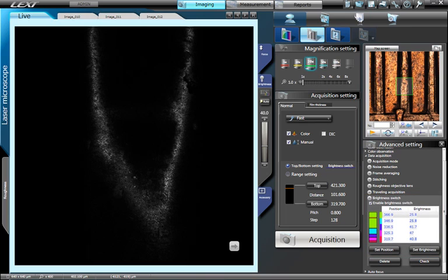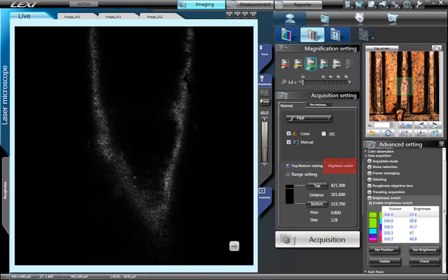To enable the brightness switch, click the button Advanced Settings, then Advanced Settings again. Under the Data Acquisition menu, check the box Enable Brightness Switch. An indication that the brightness switch is active can be found in the Acquisition Settings window.